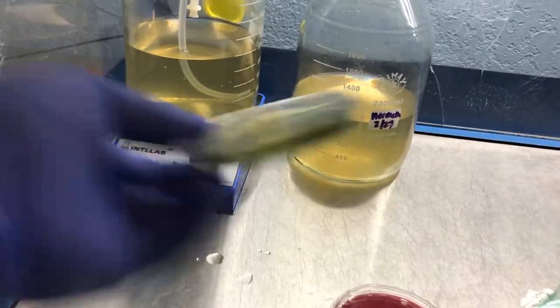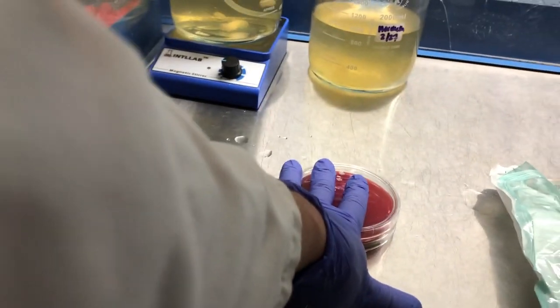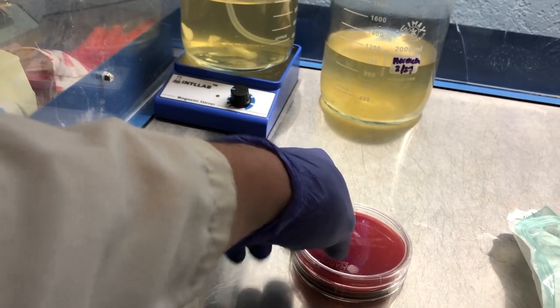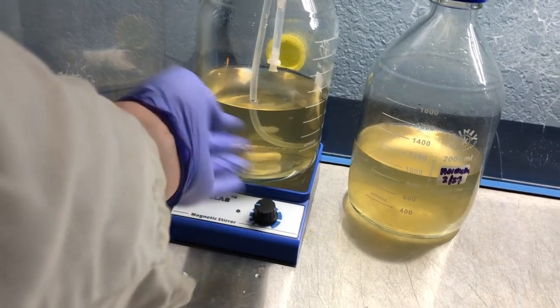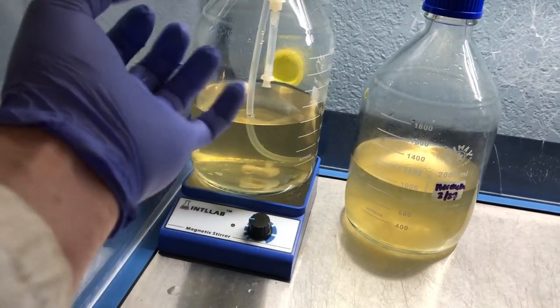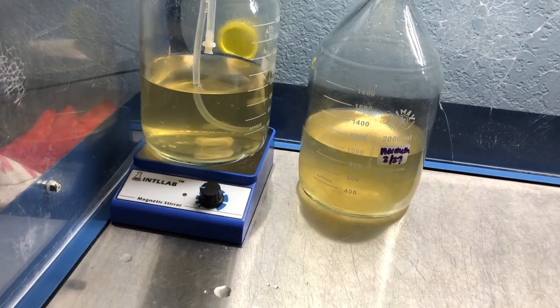and kind of let that liquid go all around, and then these will be incubating for about 3 to 5 days in the incubator at 72 degrees Fahrenheit, and that way I'll know if there's any bacteria that's growing in here. But from the looks of it, it's probably going to be negative. You could see how clear that liquid is. If there was any bacteria, it would turn like a milky color, or yeast often does that too.